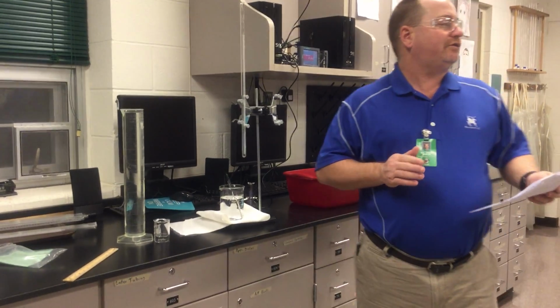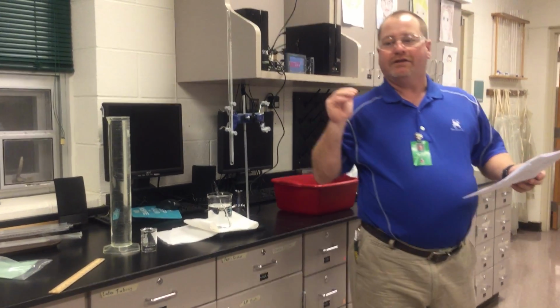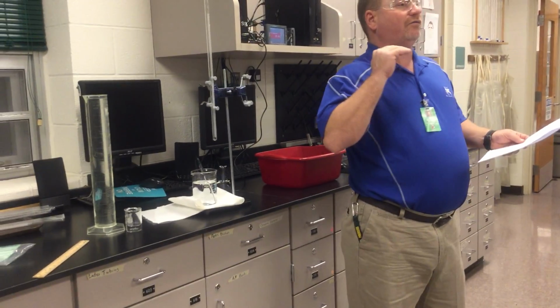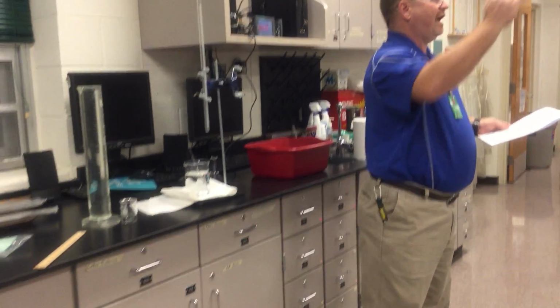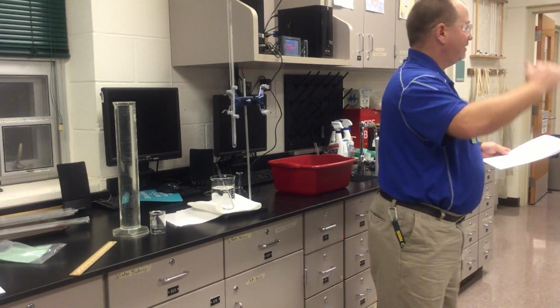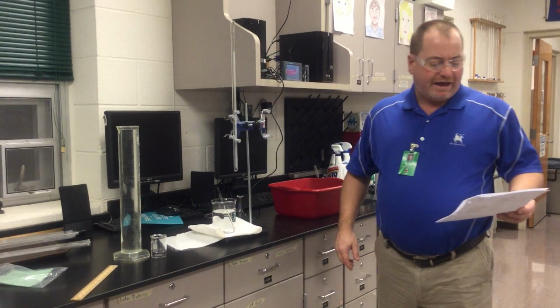So what you're going to have to do is take the standard, the 30 centimeter piece that I just told you to write down, and I said 30 centimeters weighs 0.6 grams, right? You're going to have to use that to figure out what our magnesium weighs by setting up proportions. Okay, that's one of the questions in the lab here. So you're going to have to do that.